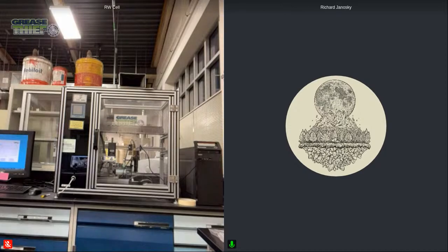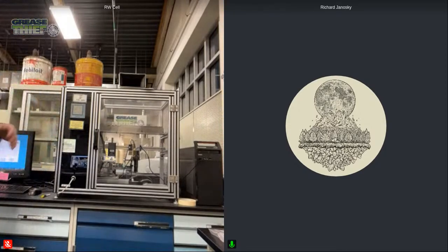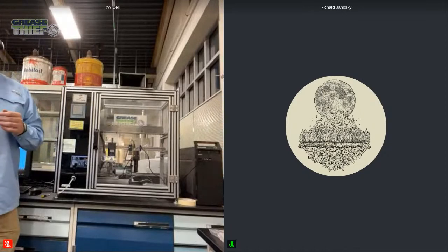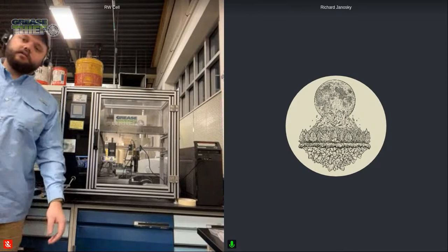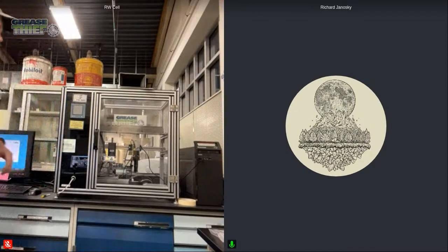Appreciate that. So welcome everybody tonight to our Grease Thief bootcamp session. Tonight we're going to be talking about die extrusion and grease particle counting, and both of those are done via ASTM D7918. So that's our standard for in-service grease analysis. So we'll start off with talking about our grease analyzer you can see here.